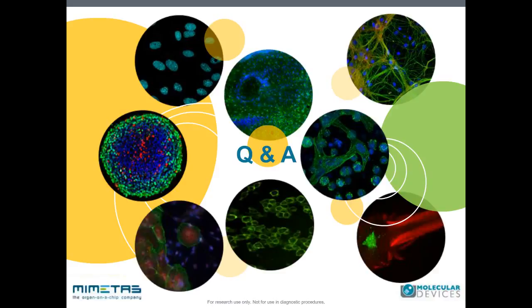For example, for the swelling assay, the image analysis is fairly straightforward. We do an edge detection. We basically simplify the image until you see the organoids as a cutout in the image. So there you only need a 2D image, which is basically converted into almost a bitmap type image. And then we do a quantification for the size of the swelling organoids.